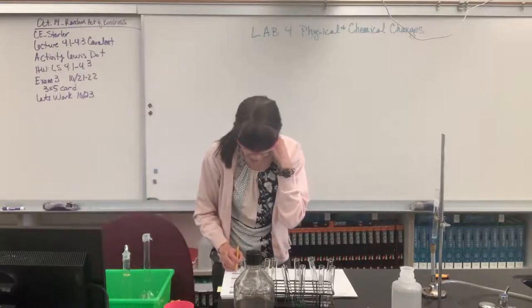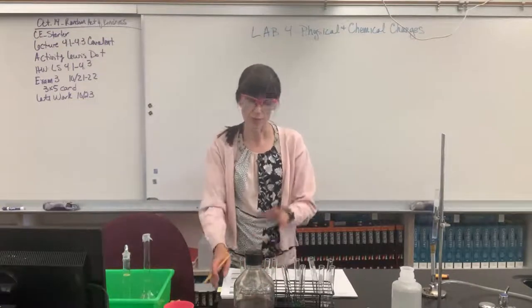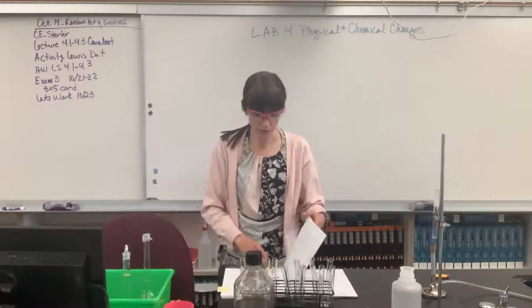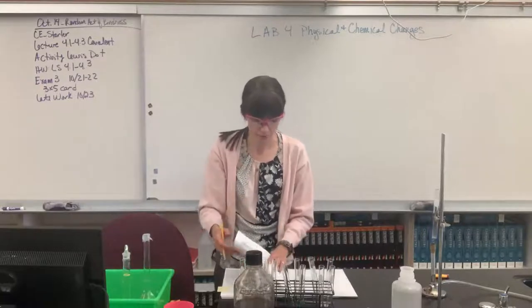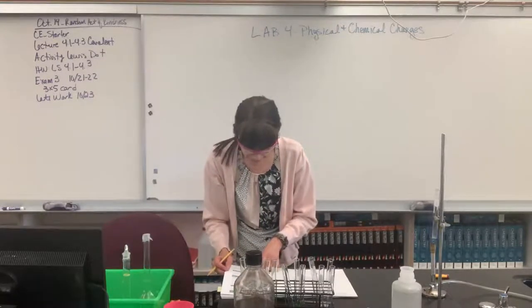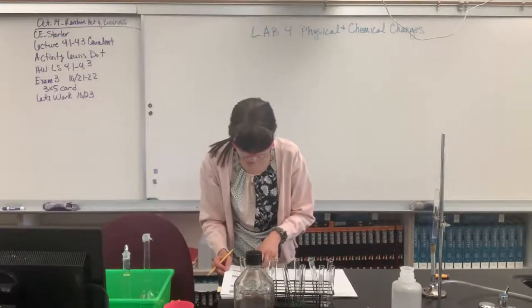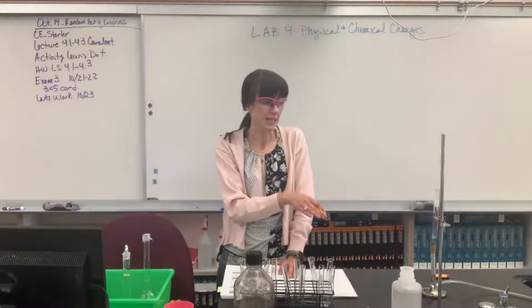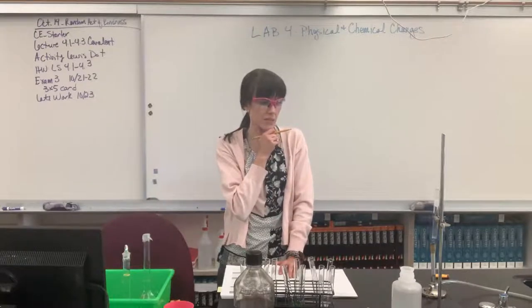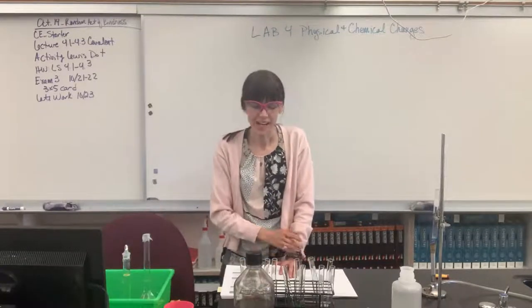It says that we need to heat this for 5 minutes and then allow the test tube to cool for 10 minutes. Record the color of the heat afterwards. So let's jump back to table 4.3 on page 53, where it says the unheated sample. Oh, great, it's green. Never mind. Sorry. Wonderful. I'm just going to let that heat for the 5 minutes and cool, and then we'll come back to it, okay? So we don't waste any time. Let's go ahead and move on to part C, and then we'll come back to this.